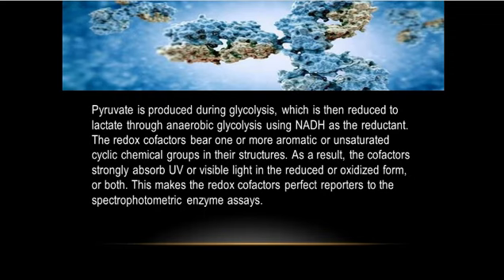The redox cofactors bear one or more aromatic or unsaturated cyclic chemical groups in their structures. As a result, the cofactors strongly absorb UV or visible light in the reduced or oxidized form, or both. This makes the redox cofactors perfect reporters for spectrophotometric enzyme assays.